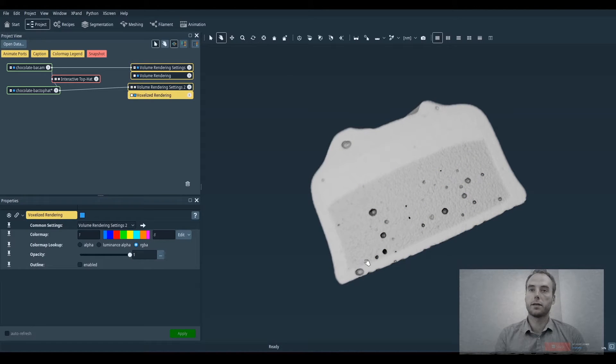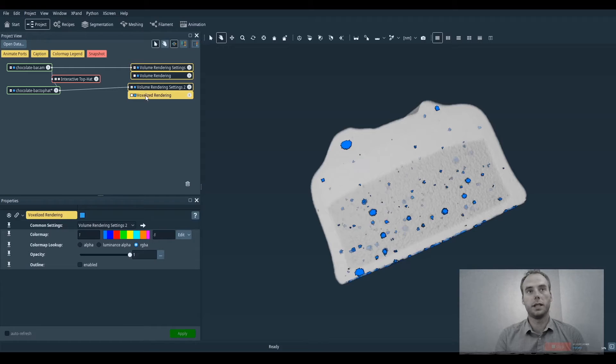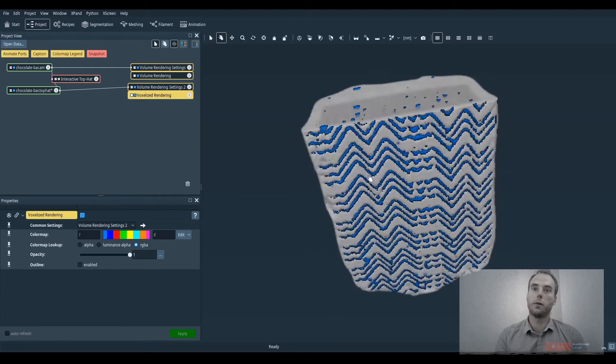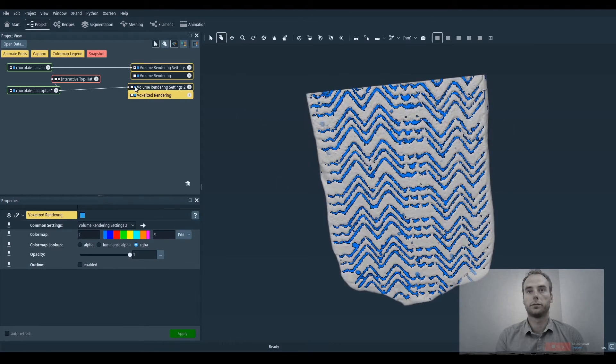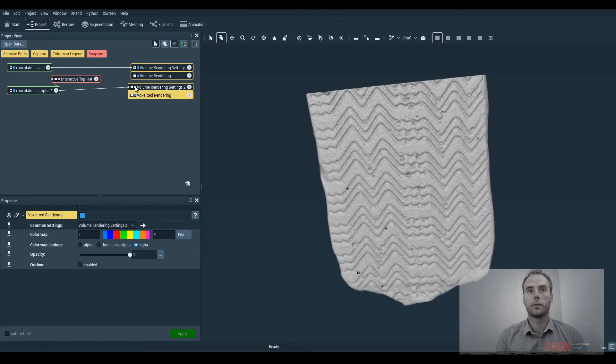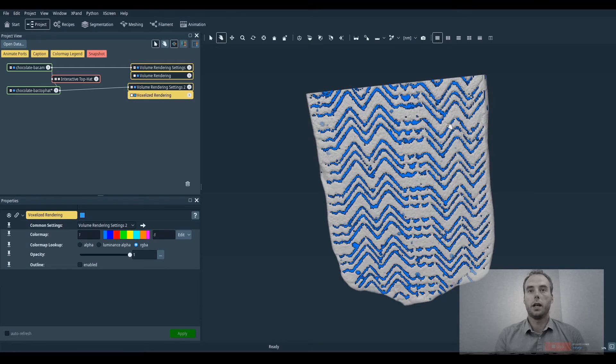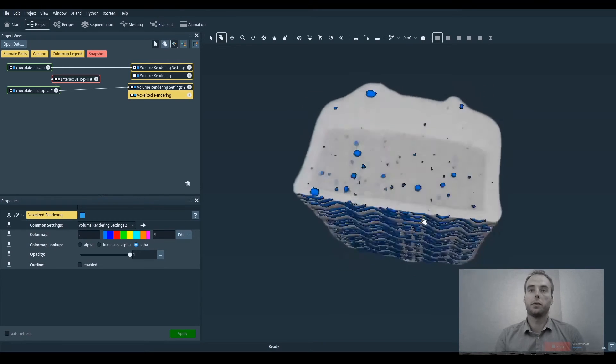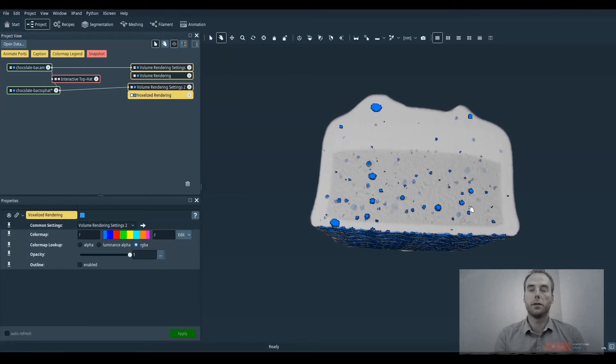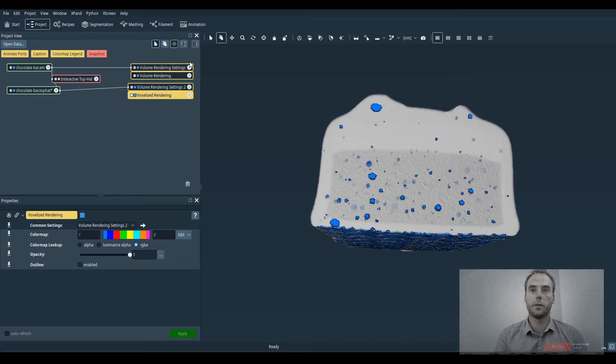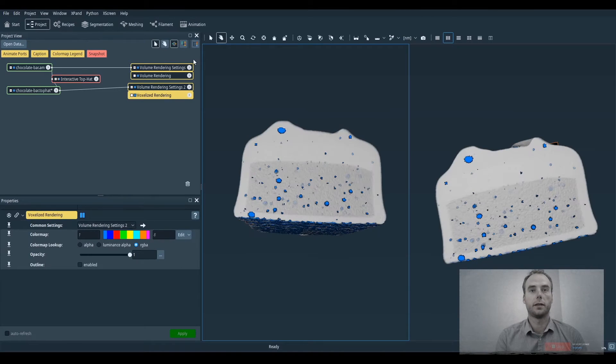Because of that we can say that this result isn't exactly what we really want. And right now we are going to improve this result by using the interactive top hat by reconstruction module instead.